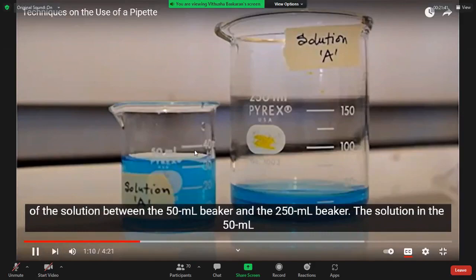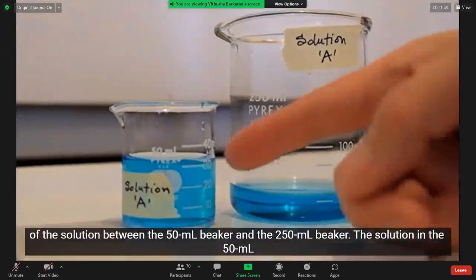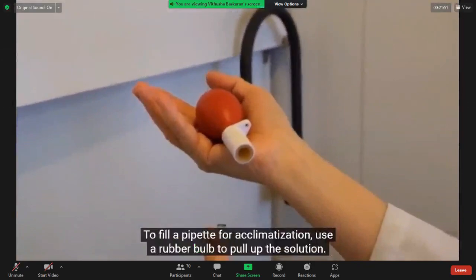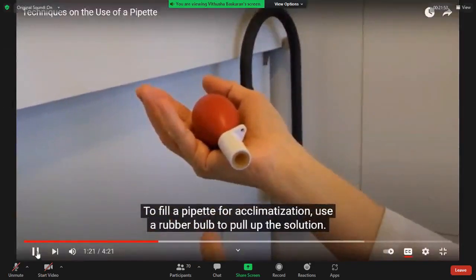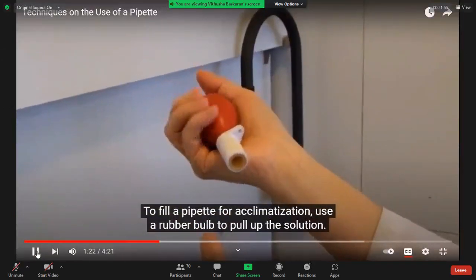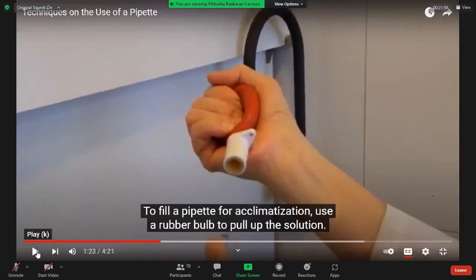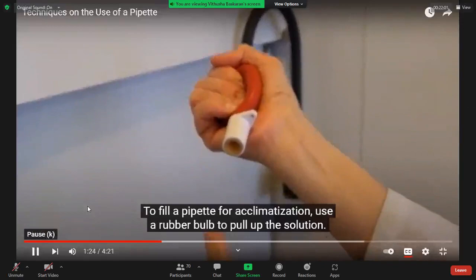Depth of the solution between the 50 mL beaker and the 250 mL beaker. The solution in the 50 mL beaker has more depth, and it will be easier to pipette the solution out of this beaker. To fill a pipette for acclimatization, use a rubber bulb. Okay, you will have this in the coming slides. This is known as the sucker.